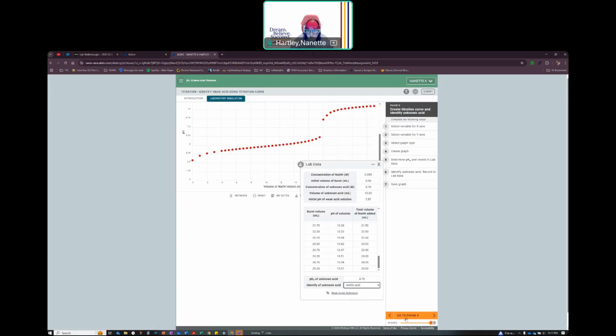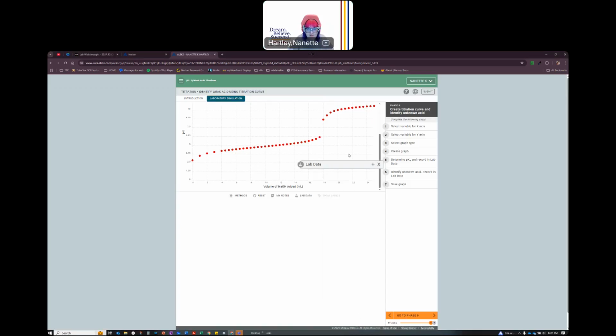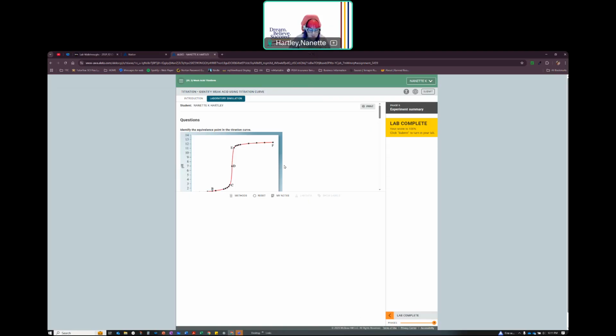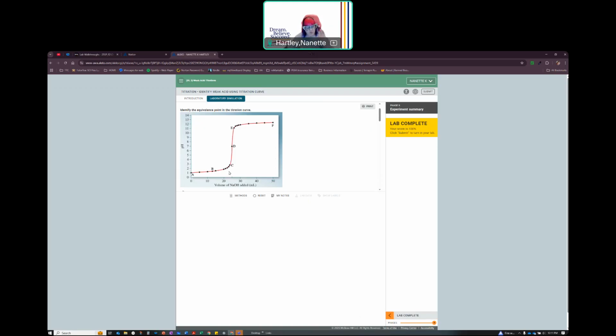And then save the graph. Do that. There. Yes, look, I did it. Awesome. Now, it's very approximate. I don't like how approximate that is, but that's what I had to do: to say, okay, it's roughly this. That's the volume there. My half volume is roughly this. Therefore, looking at the values that I had, it's got to be this one. Okay, so that's how we do that.